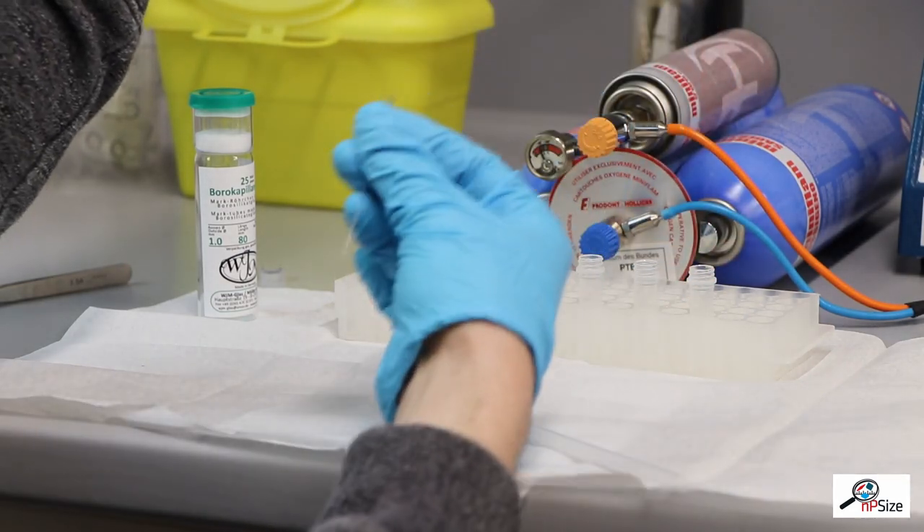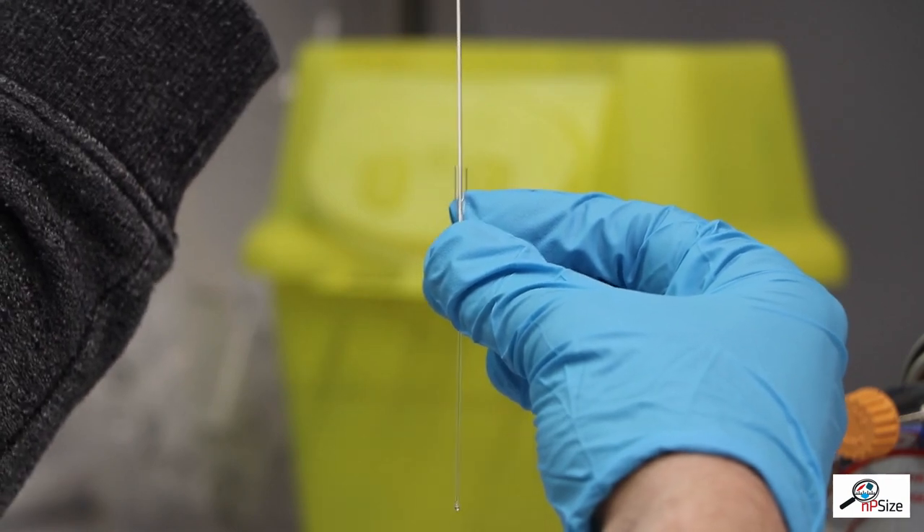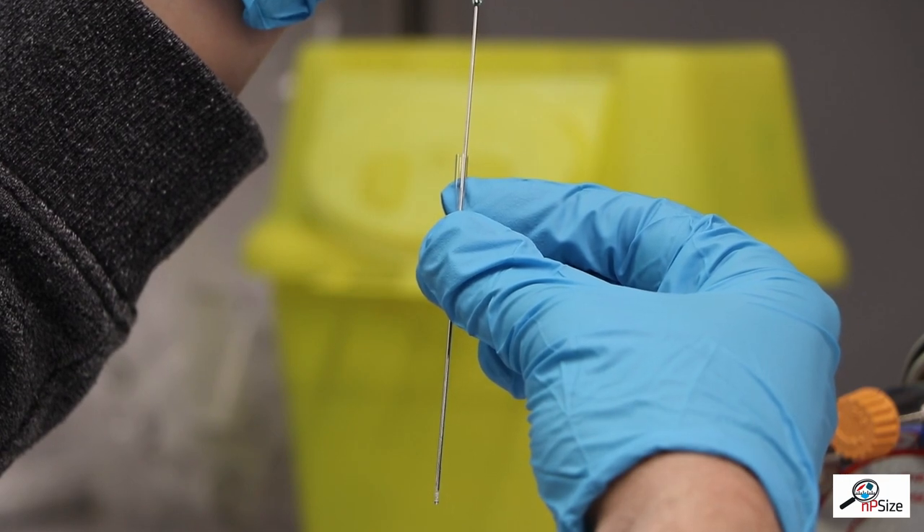The sample is carefully injected into the capillary. The whole volume required to fill the capillary is only 20 microliters — this is only a small droplet.